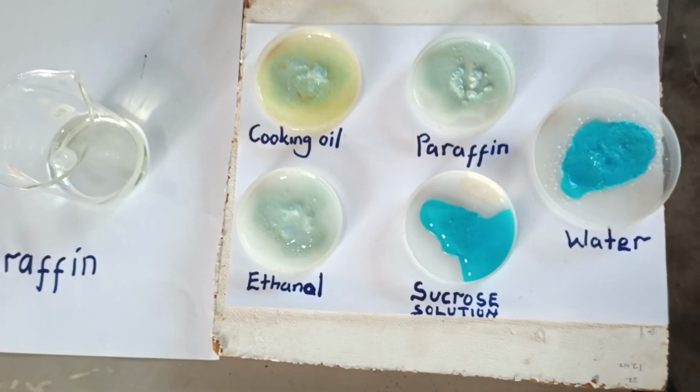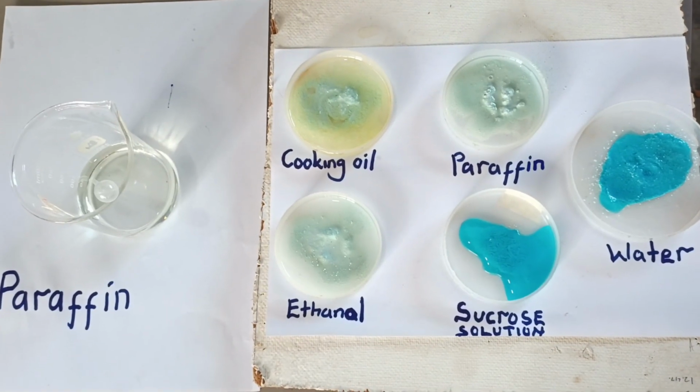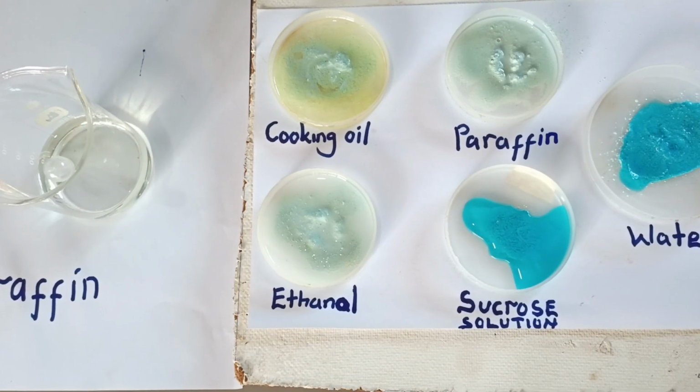In conclusion, therefore, dear chemists, not all the liquids in the laboratory are water. Water can only be detected by use of anhydrous copper 2 sulfate or cobalt paper.